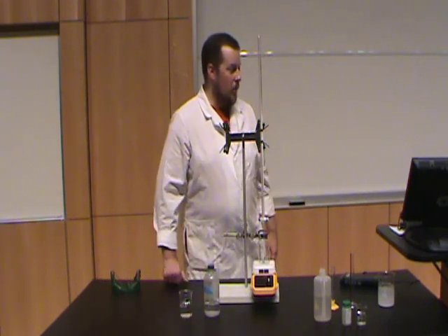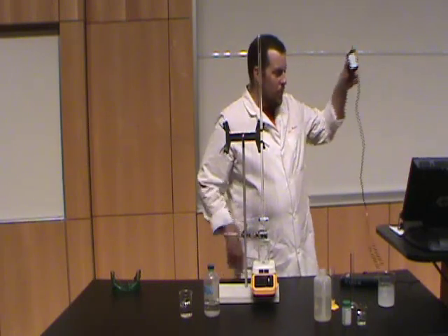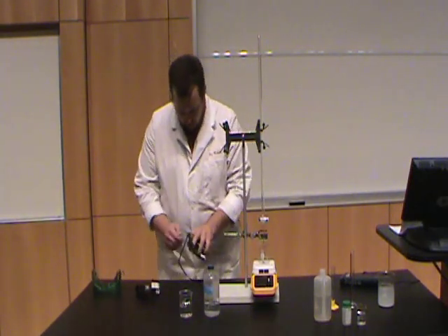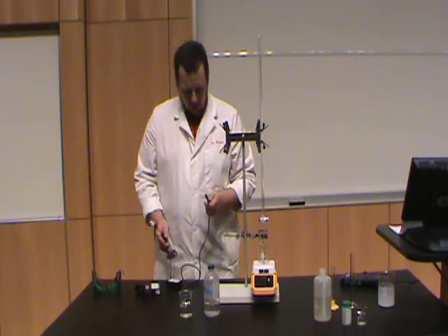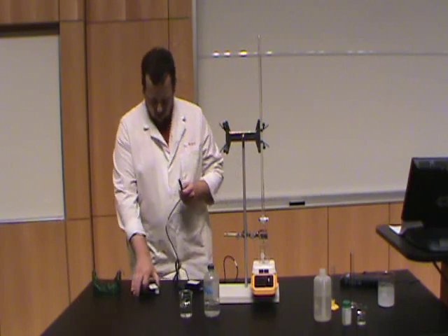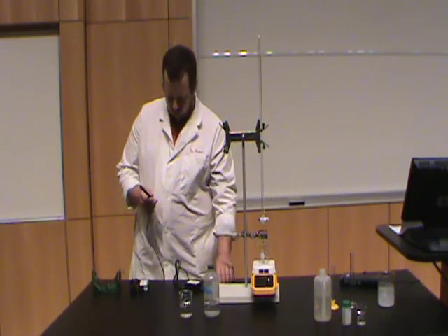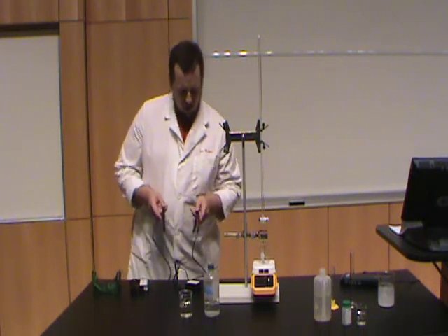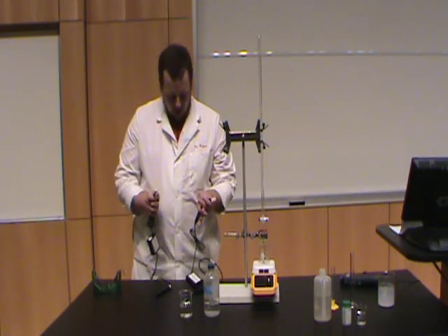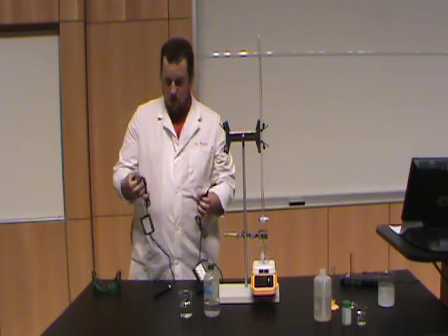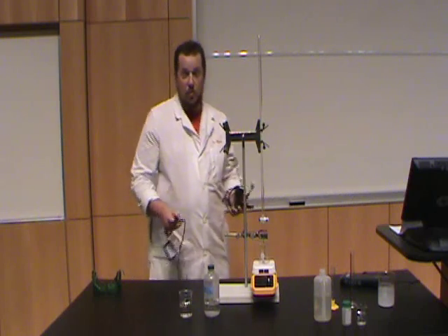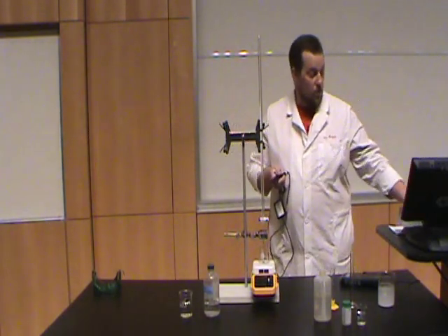We actually have two different types of conductivity probes, but unless you look really closely, you probably won't notice the difference. Here is a conductivity probe that is a little bit older, and here is one that's almost brand new. They don't look very different — this one's a little shinier. The only real difference you see is their connections: the older ones just have a little adapter in line, and the newer ones don't. Functionally, they're going to work exactly the same way; it's just a matter of how they get hooked up, and they should all be hooked up already.